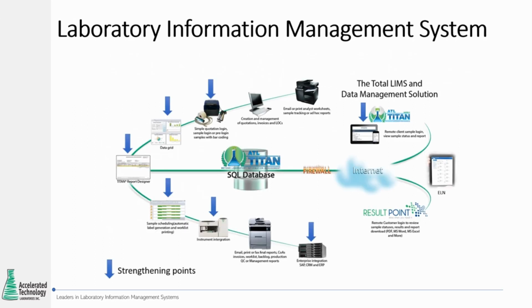If we take a look at the entire picture, I know this is a kind of a busy slide, there's a lot going on, but you can take a look at the LIMS. It's typically a SQL database. It stands for Structured Query Language. I think Microsoft SQL Server is probably one of the most popular ones, but basically, with having all this data in a central location, it gives you the power to do quite a bit. Not just centralized, standardized reporting, but you can develop dashboards for key performance indicators.